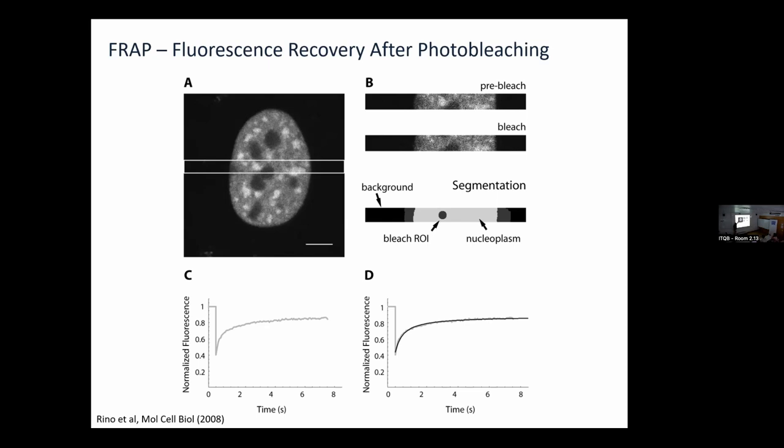This is an advantage of the confocal point scanning microscope. You can also define freely what's the area that you are imaging, so you can go faster. You can see by the noise that the scanning mirrors were moving very, very fast. And using this, we could get FRAP curves that look like this. And so we had recovery in a few seconds of our splicing factor labeled with GFP. They're moving really fast. Okay, so they were dynamic.